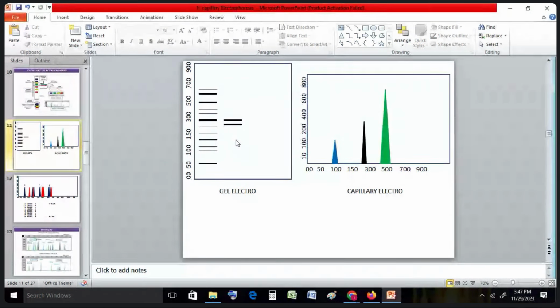If you are heterozygous, you are going to get 2 bands. Yes sir, separate bands are showing. Exactly. 2 separate size bands indicate that this locus that you have checked is heterozygous. One contains 20 repeats, another contains 15 repeats. So obviously you are getting 2 different size amplified products, and if you run them, you are going to get 2 different bands. Is that okay?